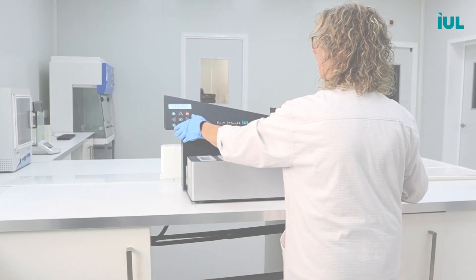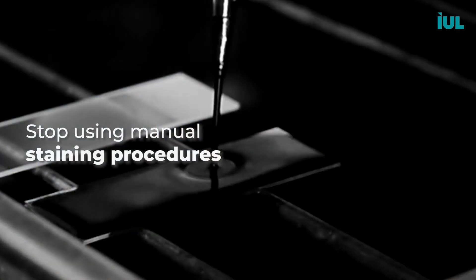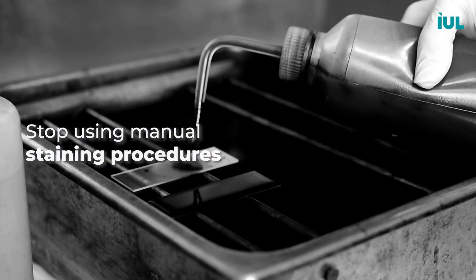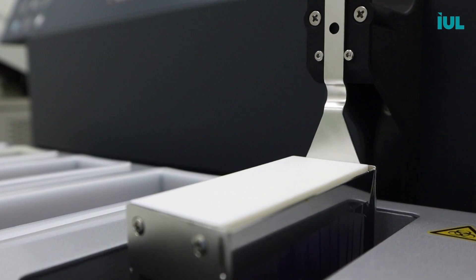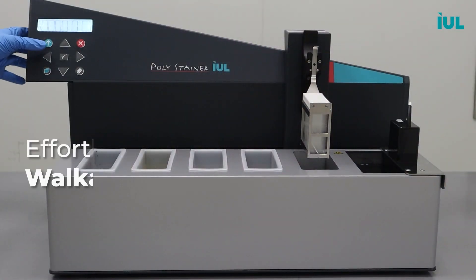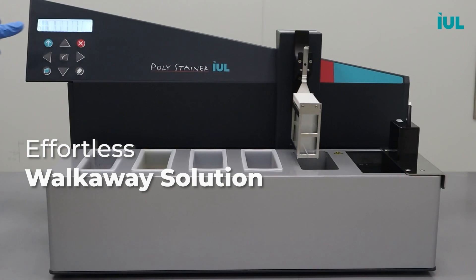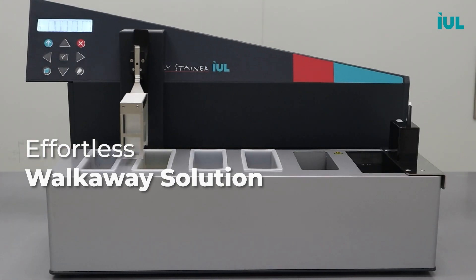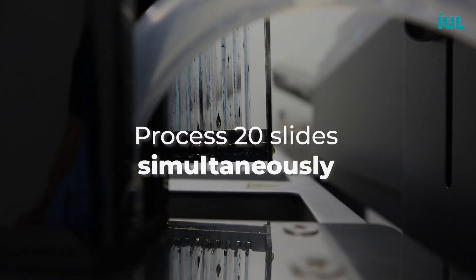Introducing the Polystainer — your laboratory's ultimate staining companion. Say goodbye to the days of tedious and time-consuming staining procedures. The Polystainer is here to revolutionize your workflow with its one-button operation, simplifying staining like never before. Just one press and you can trigger the entire staining process effortlessly. The Polystainer can process up to 20 slides simultaneously.